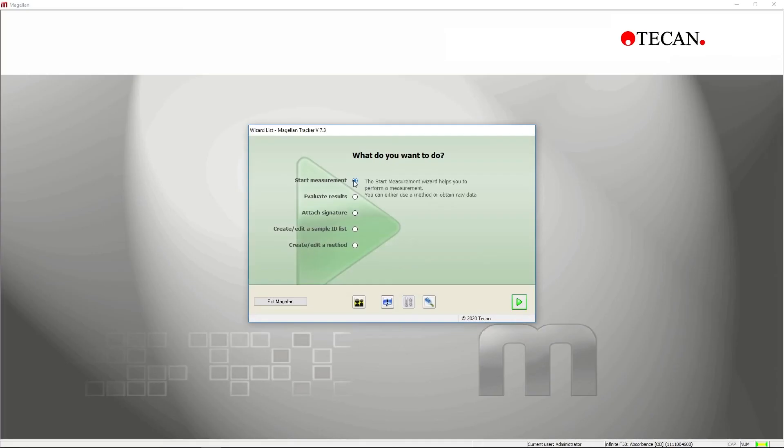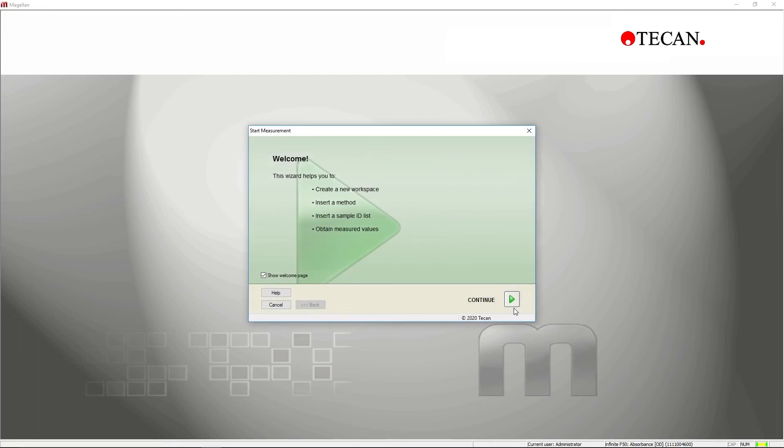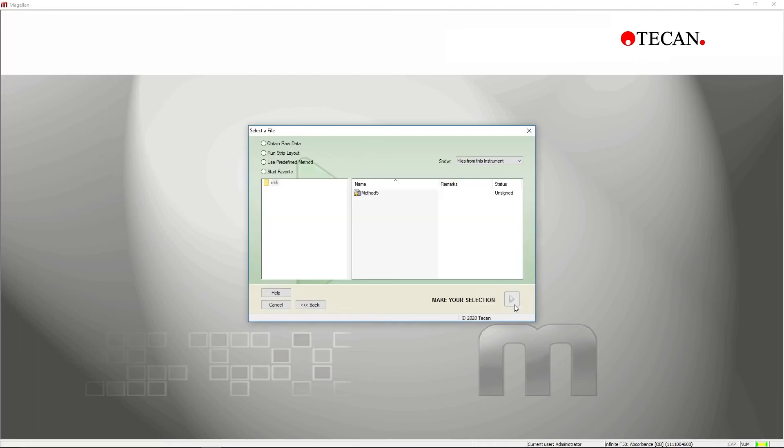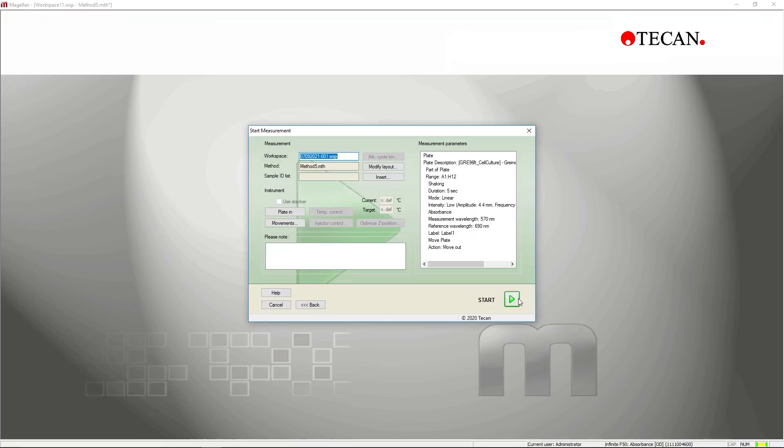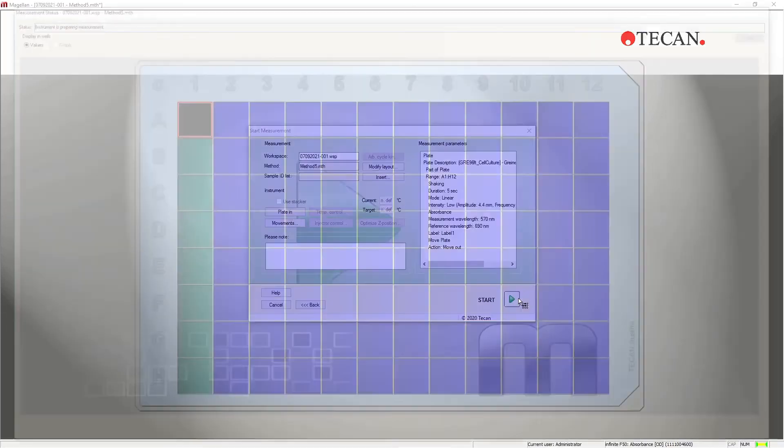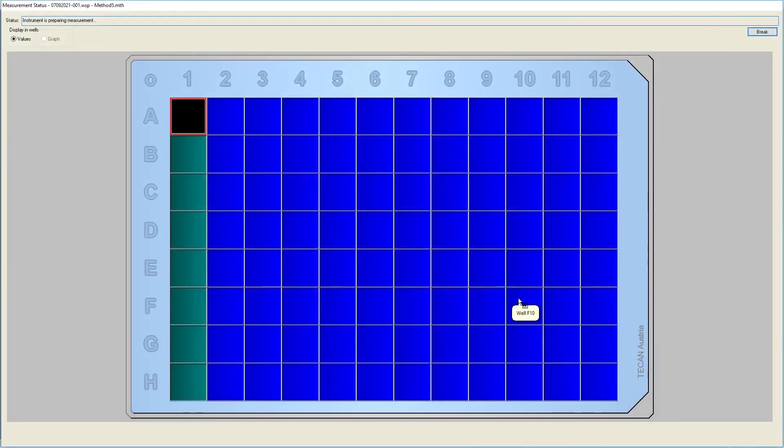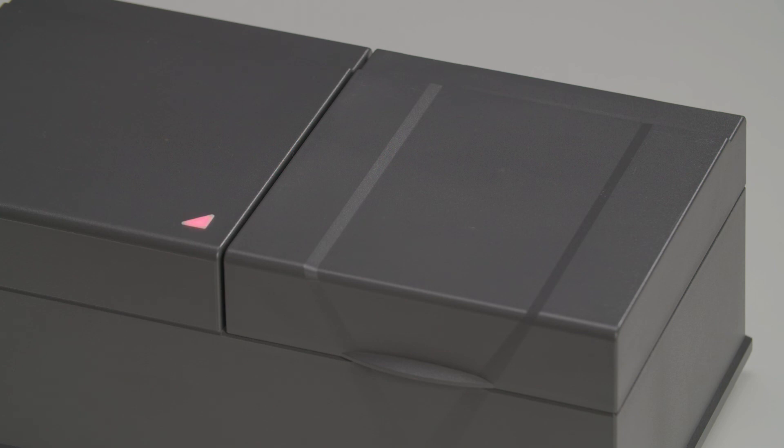To run a saved method, click on the Start measurement option on the main menu, and then select Run from existing methods. Choose the correct method file, and then click Start. The red light indicates that the measurement is proceeding.